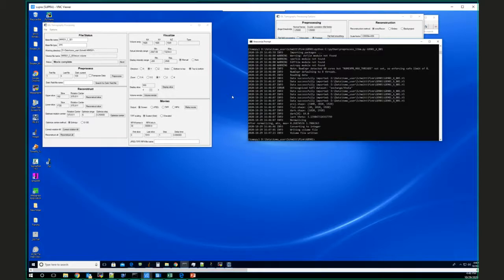And ImageJ out of the box has only fairly simple segmentation. This program has no segmentation, but ImageJ has some segmentation, based upon intensities and some more sophisticated things as well. But you probably need to look at other packages to do more complicated segmentation.